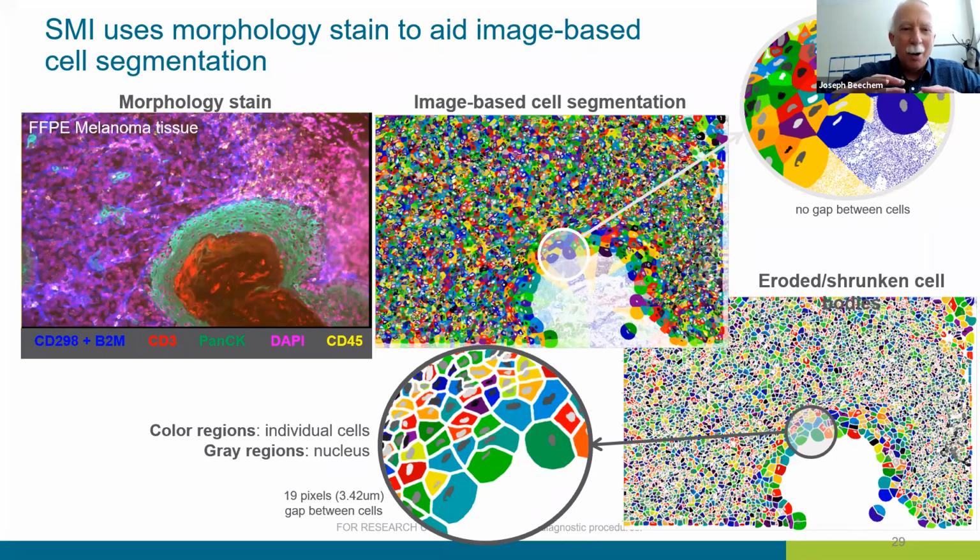You can almost sense the planes of these cells where the microtome came through, watching a nucleus rotate around in space a little bit, if you will. But we're really happy to get it to this place. We're still going to be taking it much farther, but I really like being able to use this. It's a case where the protein layer of information really is super helpful in how to pack the RNA into the right cell, if you will.